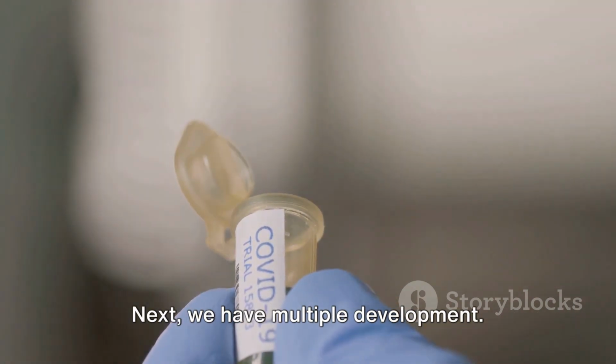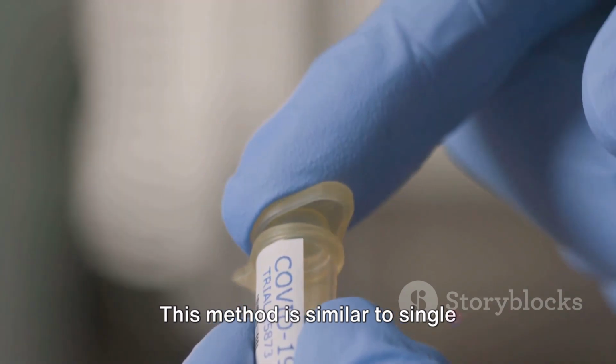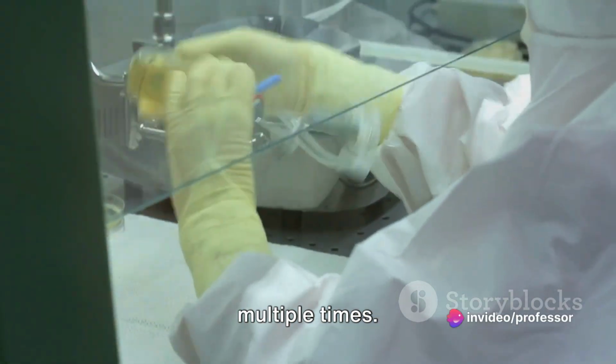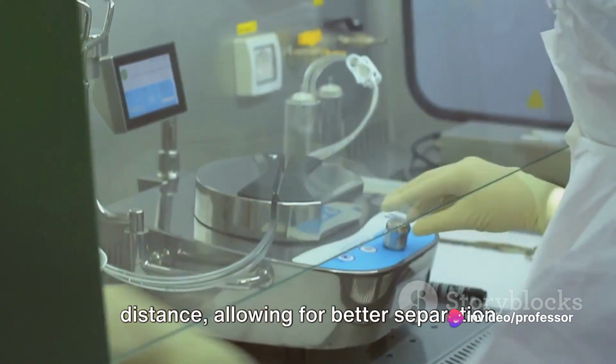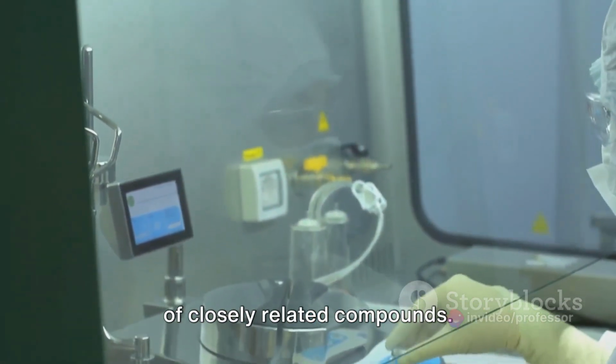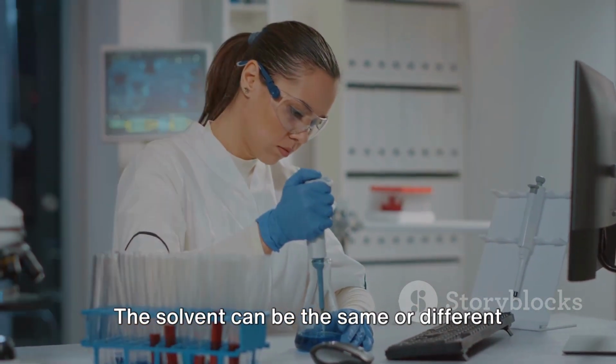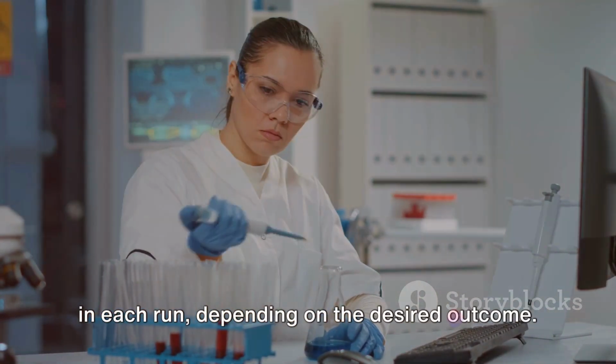Next, we have multiple development. This method is similar to single development, but the process is repeated multiple times. Each run increases the separation distance, allowing for better separation of closely related compounds. The solvent can be the same or different in each run depending on the desired outcome.